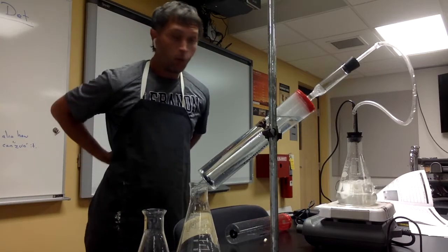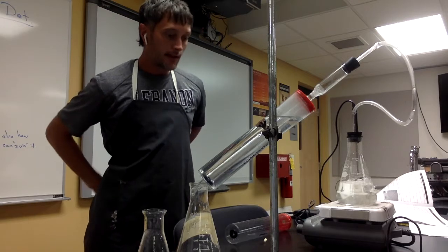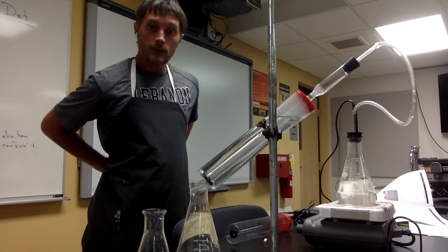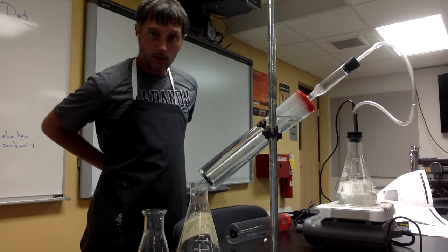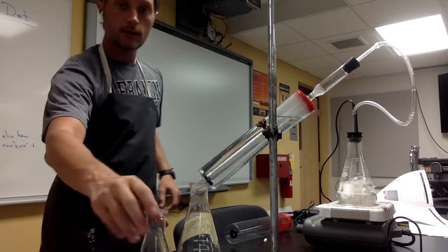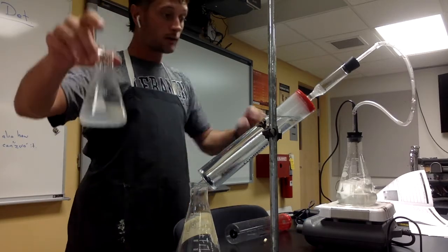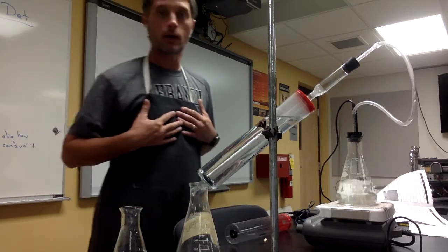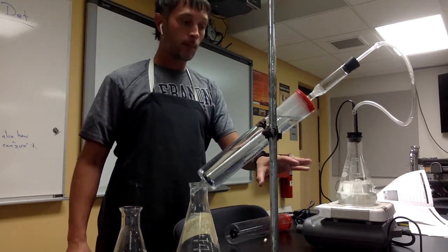So I have been boiling this for several minutes now. The liquid stopped boiling for a while. Once I boiled off all of this liquid, it stopped boiling. I keep saying water. I don't mean water. The liquid stopped boiling.